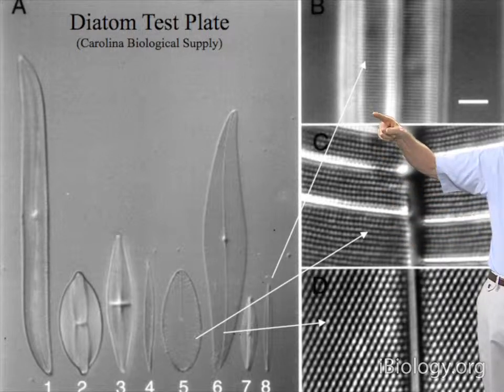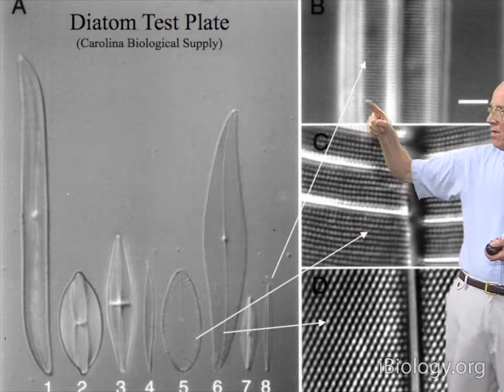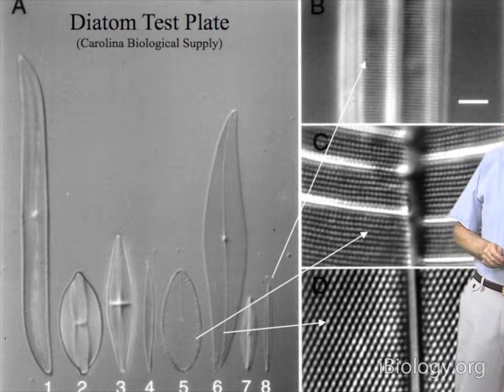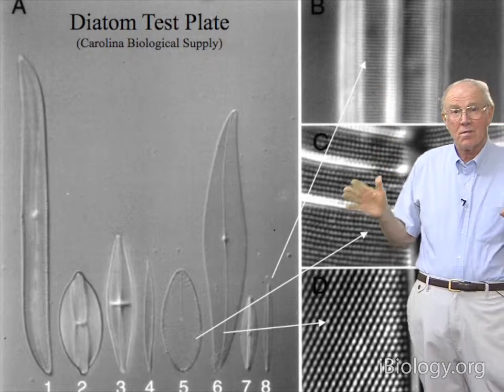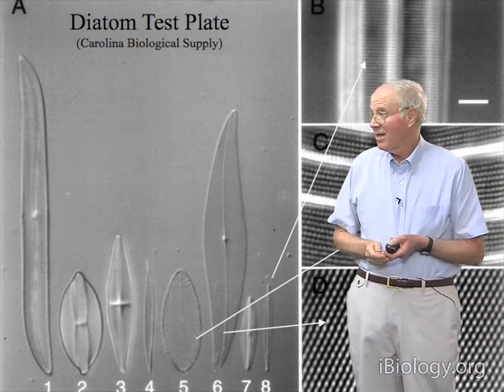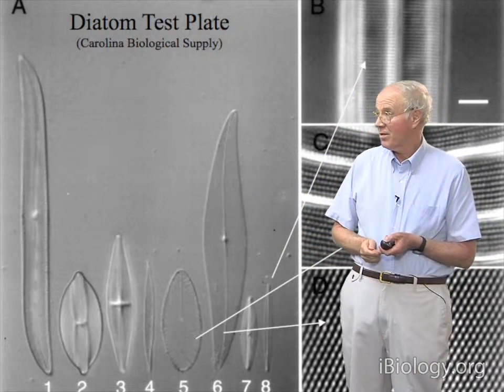And then this one here is called Amphipleura, this little guy at the very end, right? And it has rows of holes. And the rows are separated by 0.24 microns, or 240 nanometers, and the holes are separated by 170 nanometers. And these images were taken in green 550 nanometer light, and you can't see the holes, even though we're working at maximum resolution. If you put a blue filter in there so you can shorten the wavelength, then the holes become very easily distinguishable. I hope these can still be made available. They're really nice for checking out your microscope.